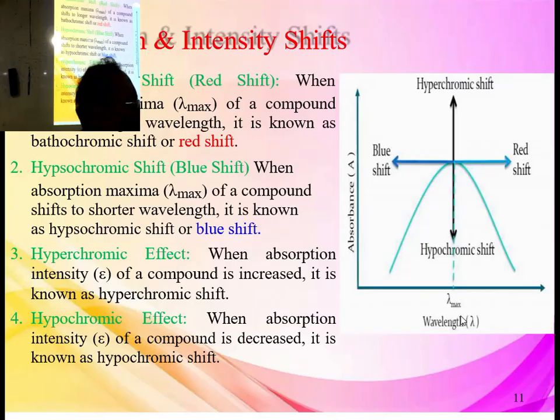Recently I was scanning some papaya juice and found the peak is around that value I told you, 197.6 lambda max. That means I have got a plot like this, as we have on the board. So the maximum intensity of absorption, that is lambda max. In other regions also there is absorption. Absorption is a wide peak I have got. That means there is absorption starting from here and then going up means more and more absorption. But when it is maximum, that is lambda max.